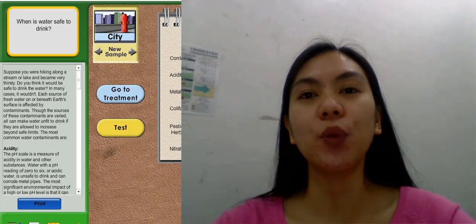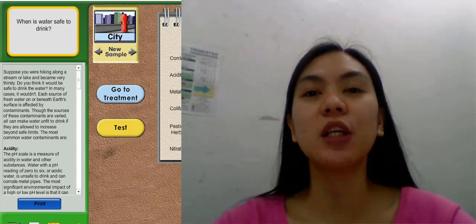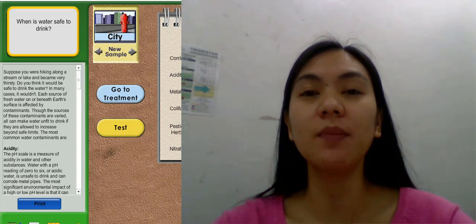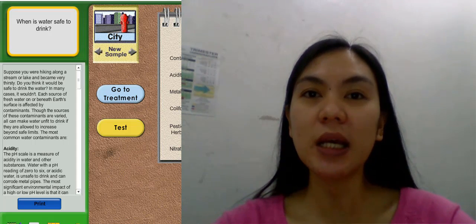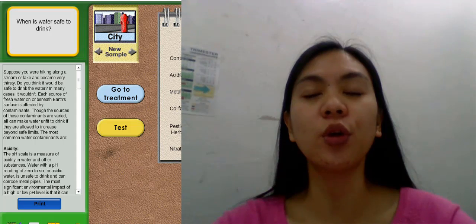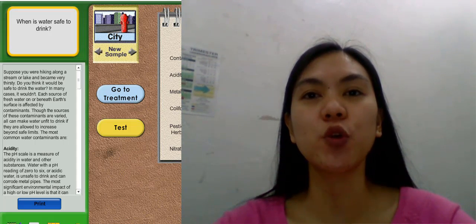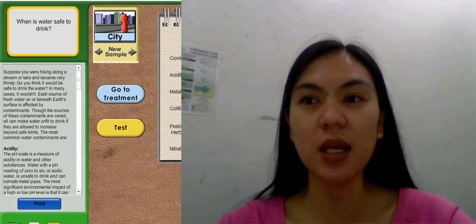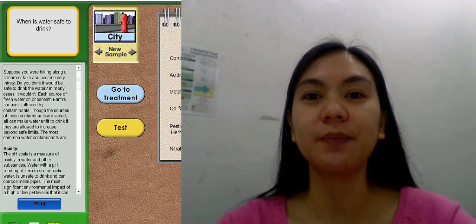Previously, I already showed you the theoretical discussion behind your experiment number 4, Mechanical Properties of Materials. Today, you will be performing experiment number 5, Water Purification. I will just be showing you a very short simulation activity and then you will be doing it on your own.